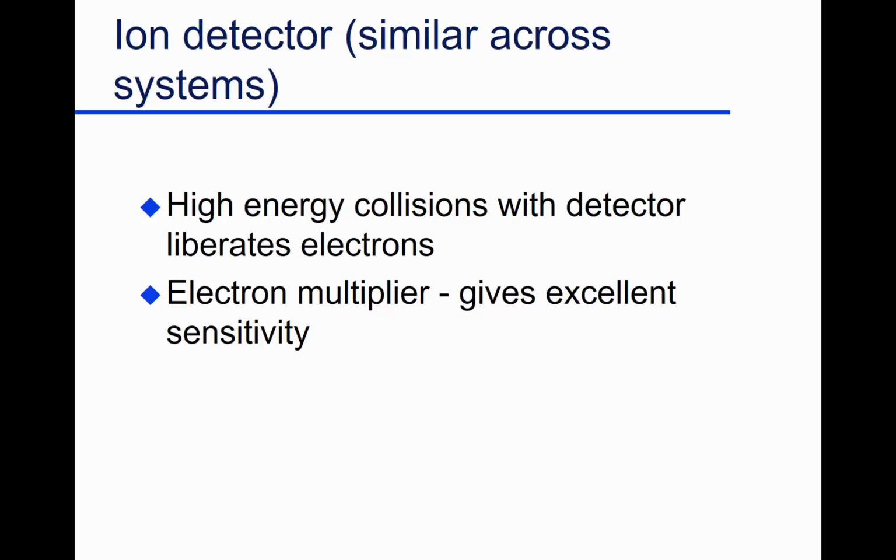And that's where we're blowing these molecules into bits and fragments, whatever we want to call them, and they have a charge on them. So there's some negative, some positive, some neutral. And we generally look for those positive fragments. In a few cases where we don't see much difference in positive, we will look at negative, but that's pretty much rare. So the next step: we've separated these, so coming out of our mass analyzer, we have simply one mass, one charge at a time.